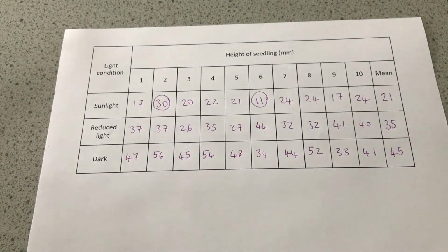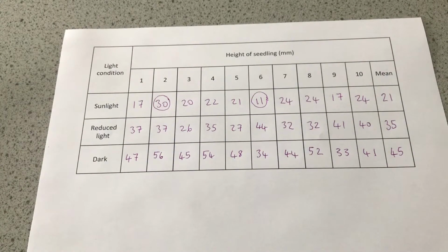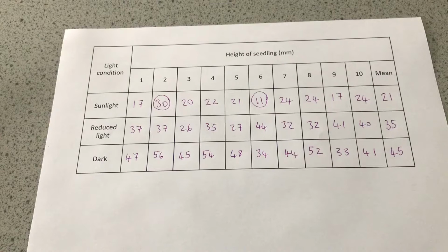So we just look at our mean data now. We can see in bright light the mean height of seedlings is 21 millimetres, reduced light 35 millimetres, and dark 45 millimetres. Now what people attempted to talk about when they analyse this data is that in the dark situation, that the plants are growing tall, they're trying to get to the light. They're not trying to get to light because there is no light. They're not going to where the light was or where they think the light is. It is all down to geotropism or gravitropism, depending on what you want to call it.